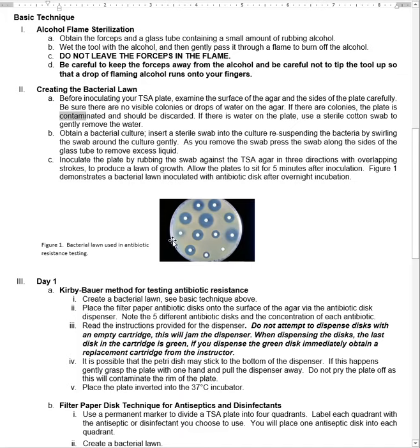This one is pretty weak. I don't know, I'd say this one is probably the strongest one, but you'd have to actually get a ruler and measure it in millimeters. That's how we do it.